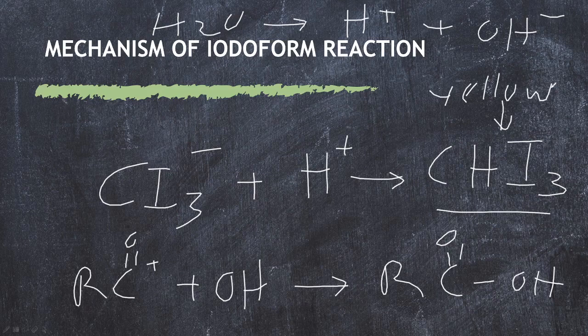Later on in further videos, I'll show you how to differentiate between aldehydes and ketones, but for now this is just the test for carbonyl compounds.